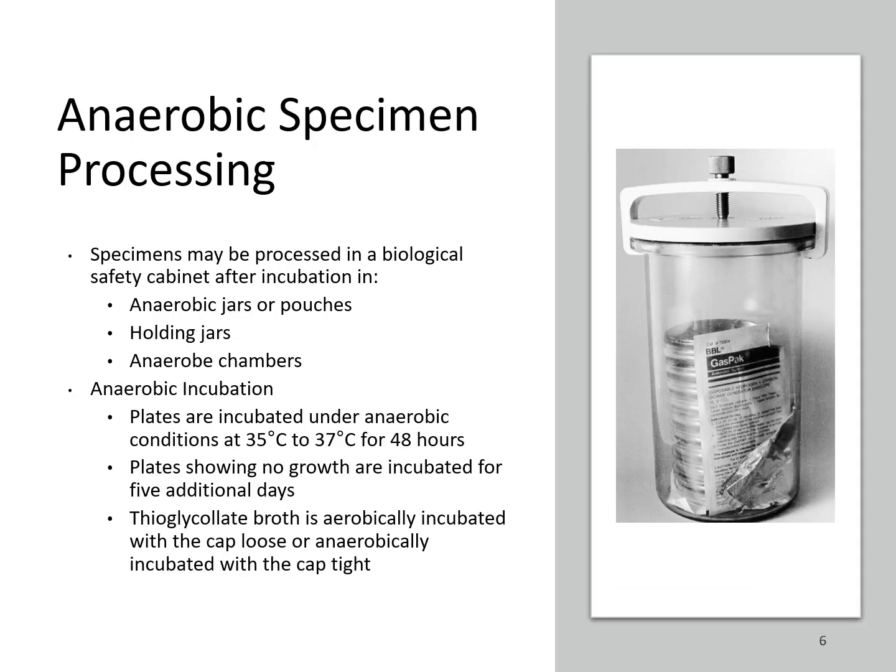The specimens are processed in a biological safety cabinet, and then these organisms are incubated in special conditions. So it could be something like an anaerobic jar, or some sort of holding jar, which you can see over here to the right, where a gas pack has been placed in there to remove the oxygen, and then it's sealed shut, and then that gas pack will remove the oxygen, and so that environment will stay anaerobic without the presence of oxygen.